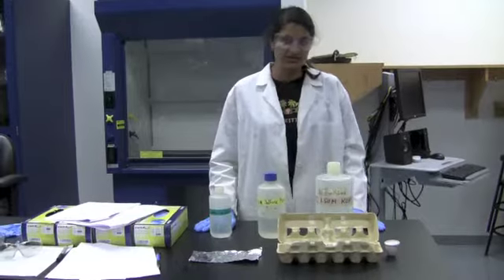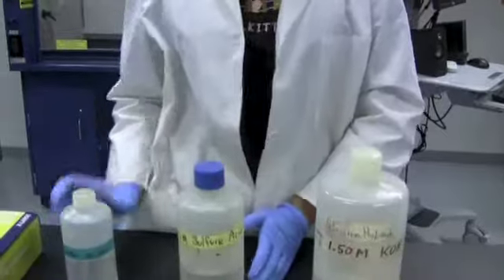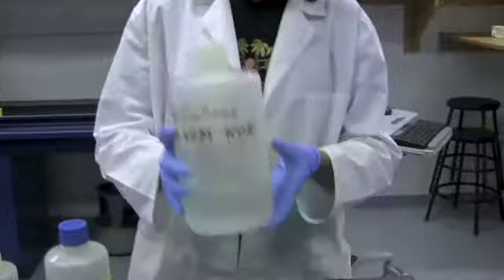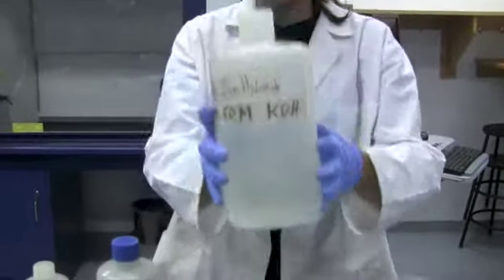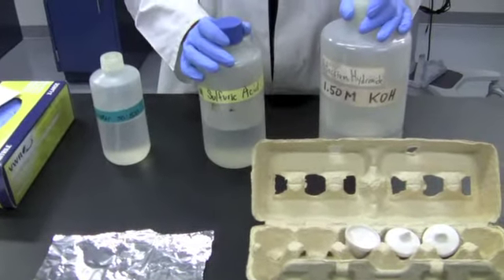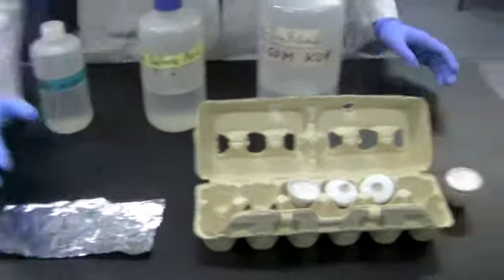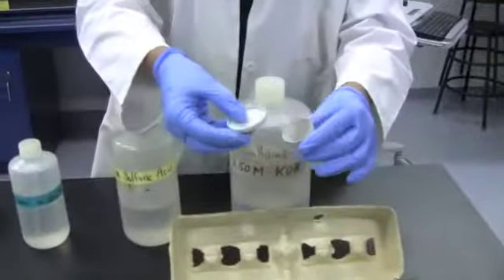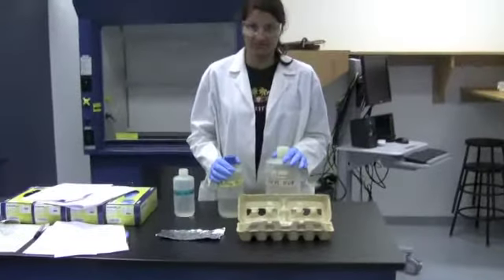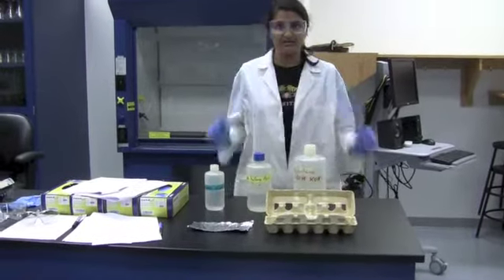In week 1, the materials that you're going to be using are a 50-50 water and alcohol solution. You're also going to be using 3 molar sulfuric acid, 1.5 molar potassium hydroxide. And just remember that all of these need to be recorded in your lab notebooks because these molarities are going to be very important for your data and your calculations. You're going to also be using aluminum foil, and at the end of the day you're going to be weighing out this crucible. Now remember, because you're handling 3 molar sulfuric acid and 1.5 molar potassium hydroxide, that you should be wearing rubber gloves and also wear your lab goggles and closed-toed shoes.